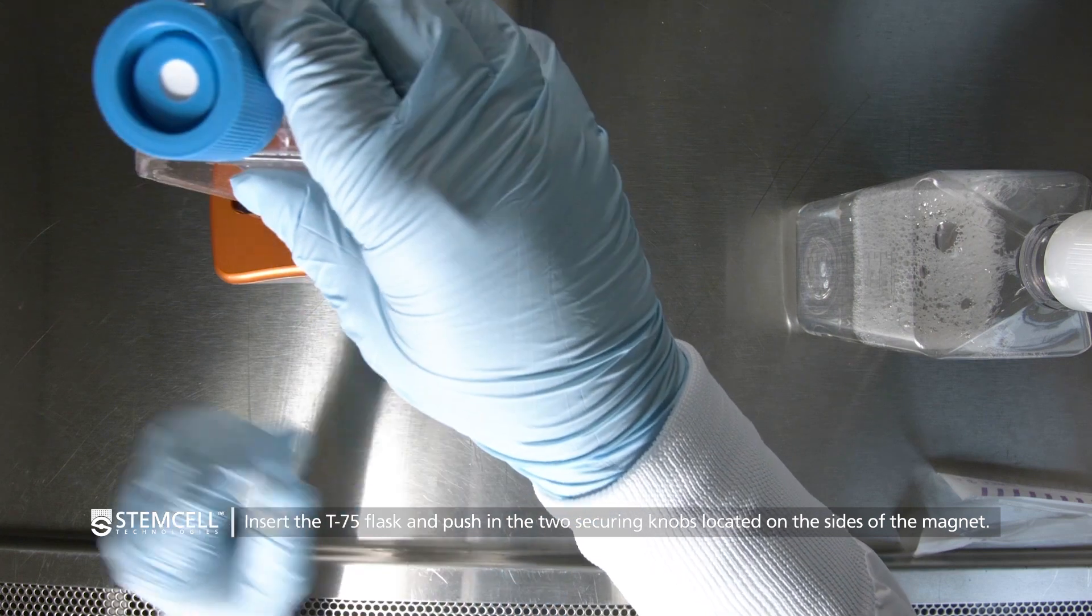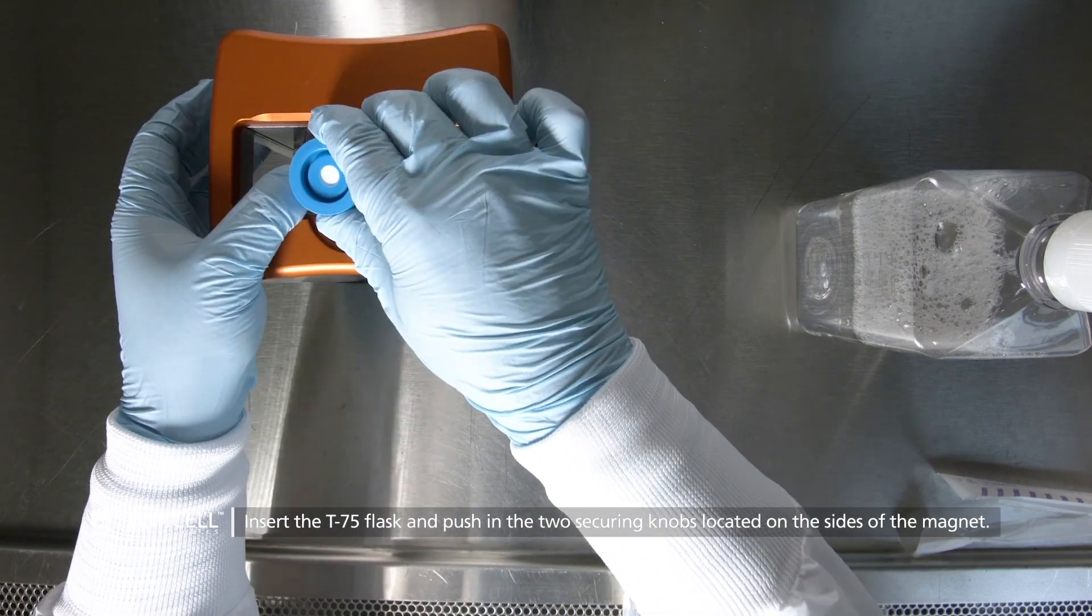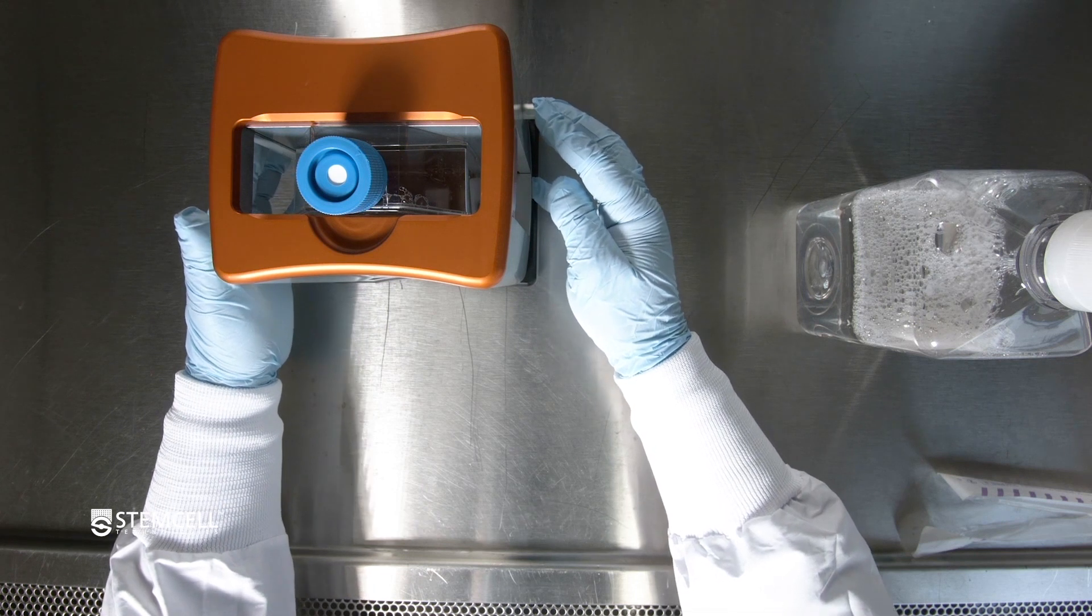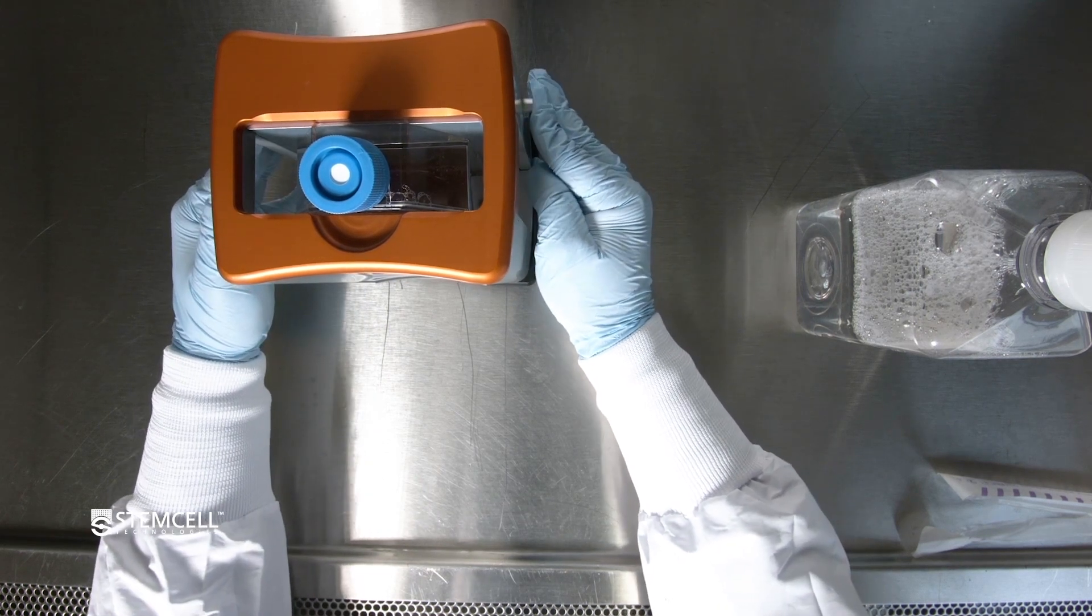Then, insert the T75 flask and push in the two securing knobs located on the sides of the magnet. This will release the spring to ensure the flask sits tightly in the magnet.